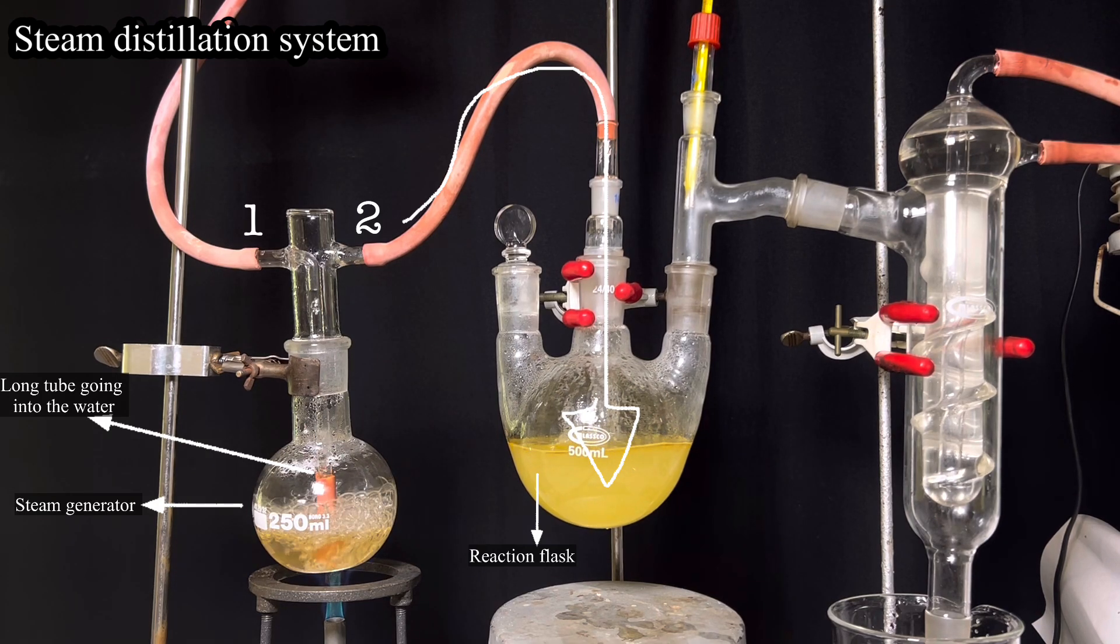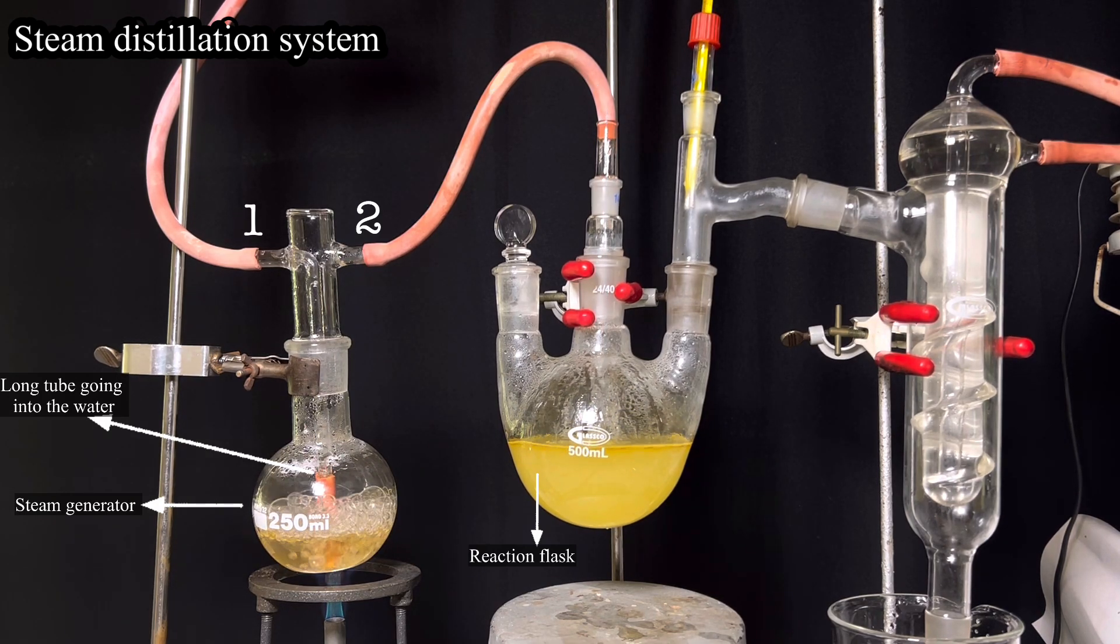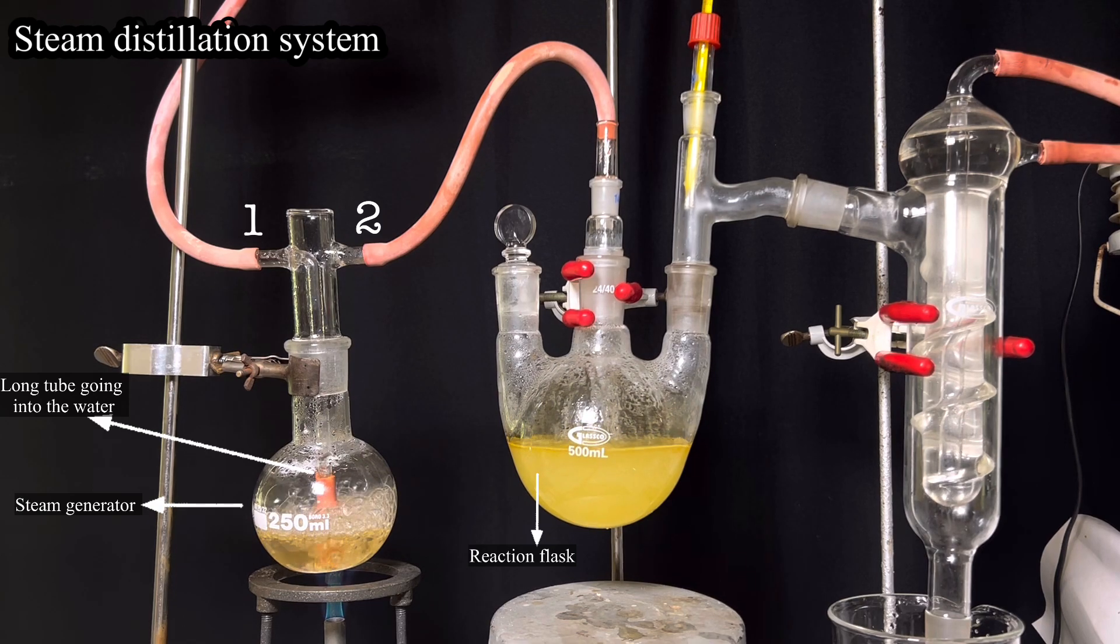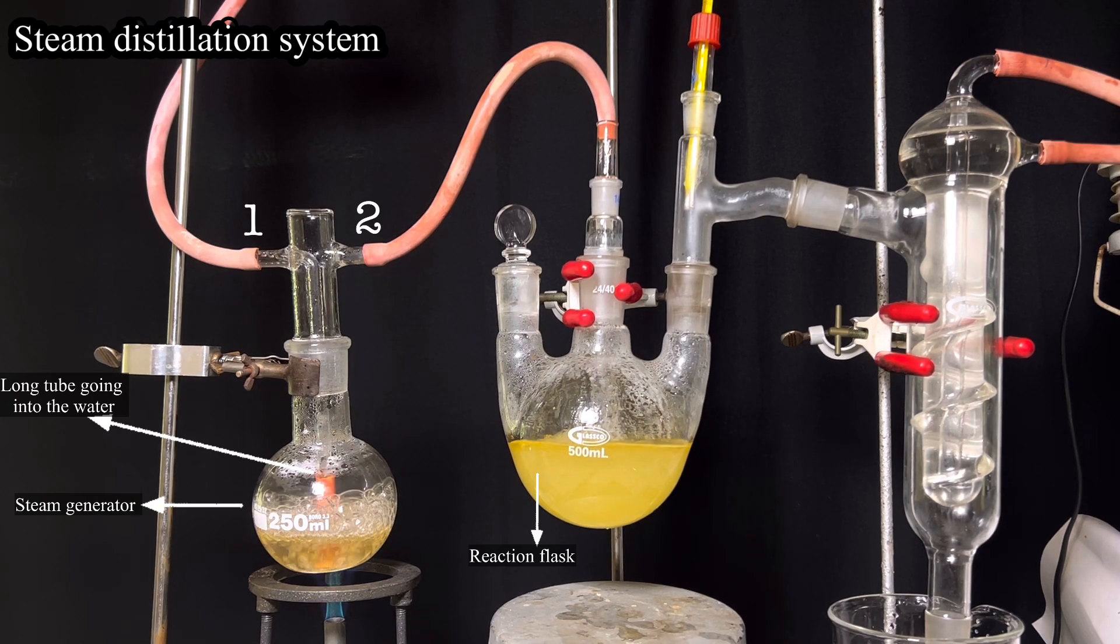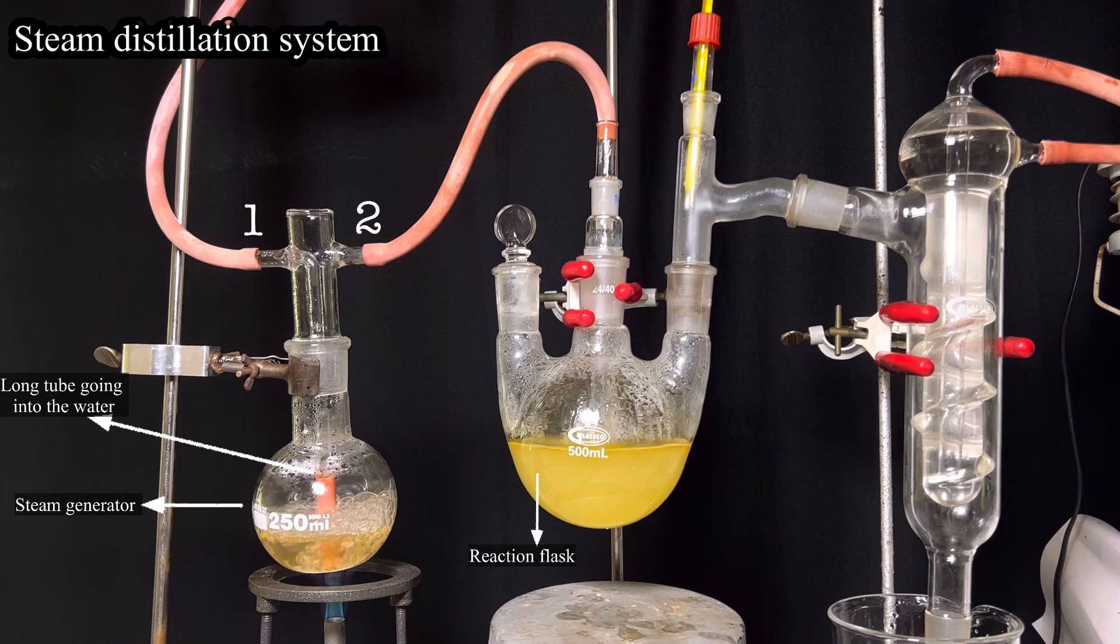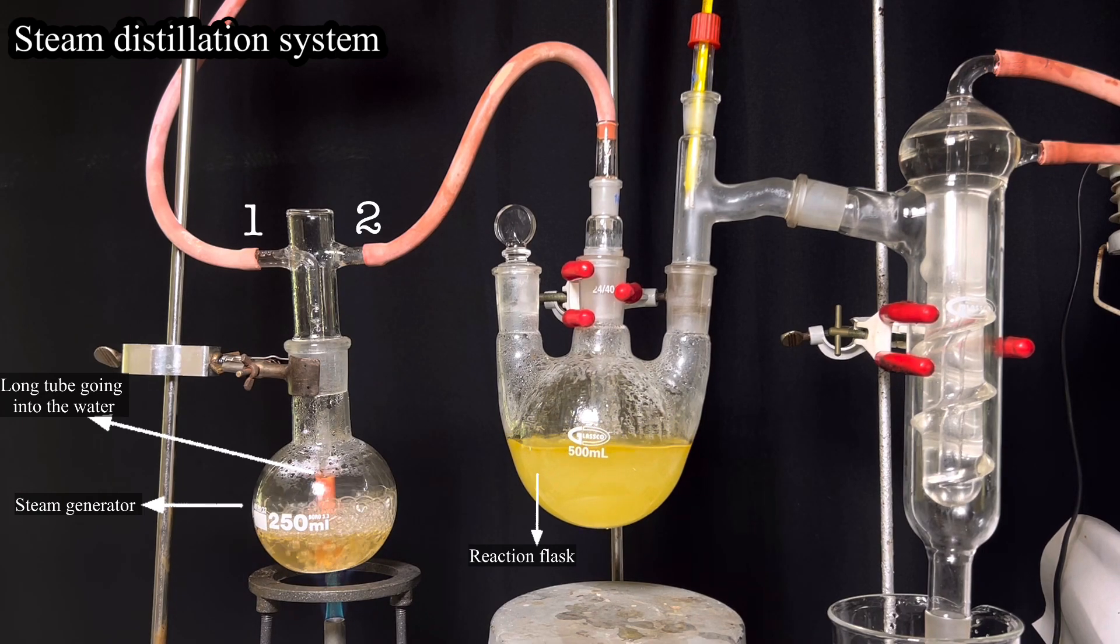Ideally, the steam generator flask should be of larger size so that effective steam could be generated. In my case, I did not have any large flask with 29-32 mm joint as the steam adapter that I had could only fit to that size. Water in the steam generator flask was boiled using a Bunsen burner.